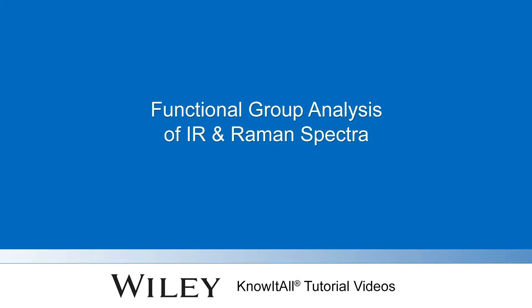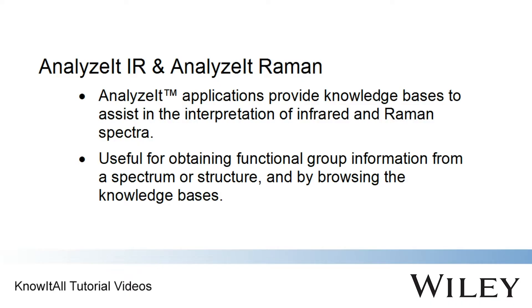Welcome to a demonstration of how to perform a basic analysis of IR and Raman spectra in the Know-It-All informatics system. The Analyze-It IR and Analyze-It-Raman applications can be used to help interpret spectra through the use of their knowledge bases of over 200 functional groups.